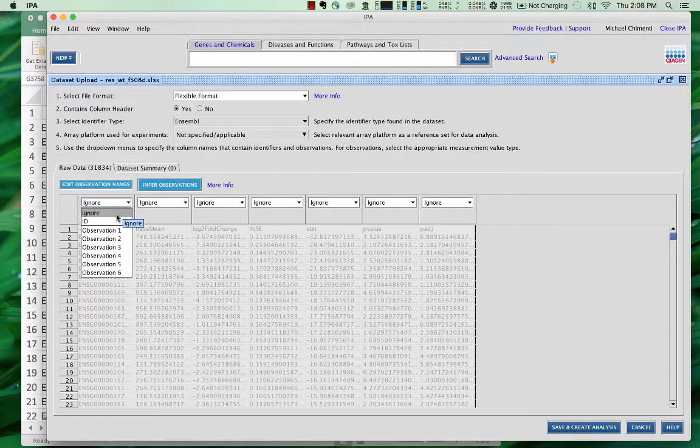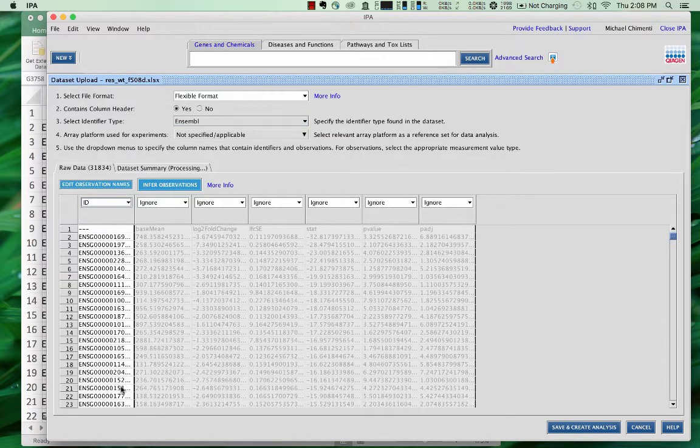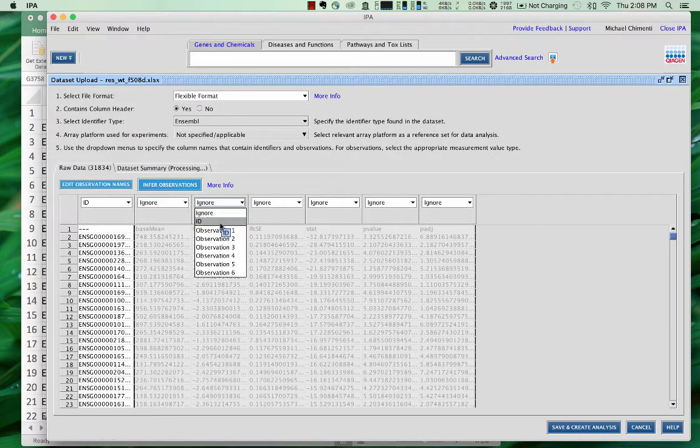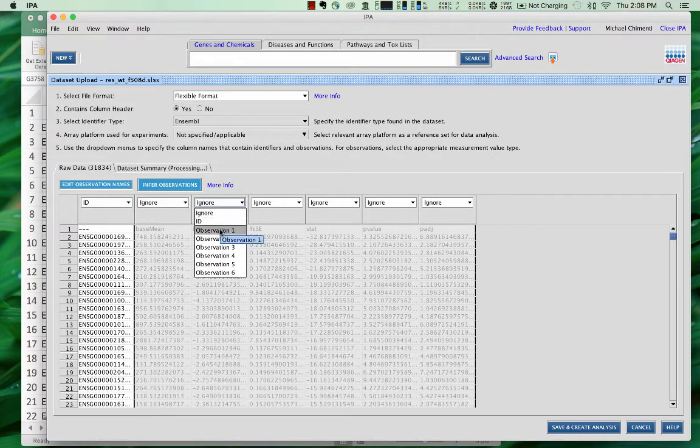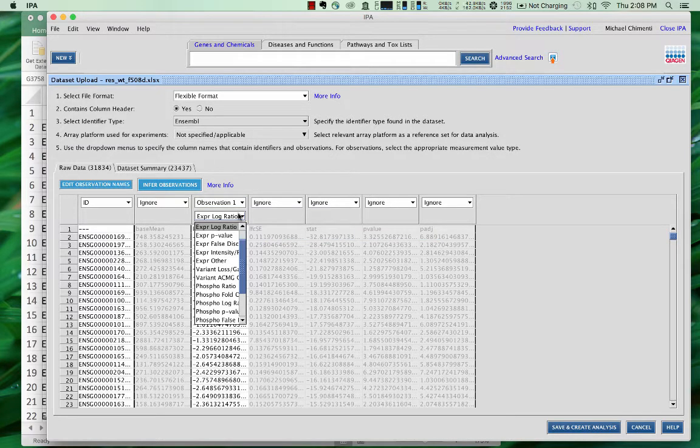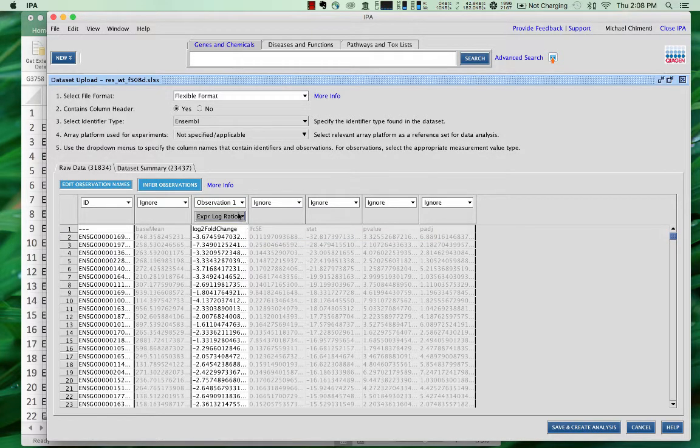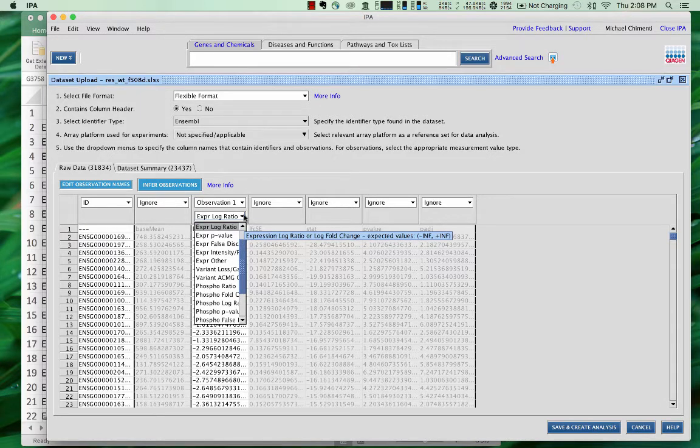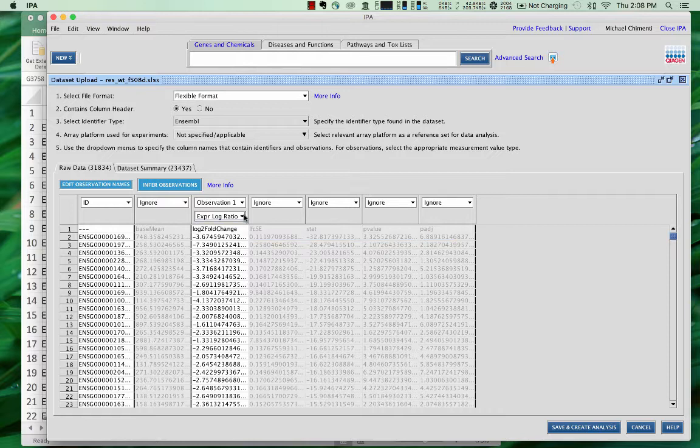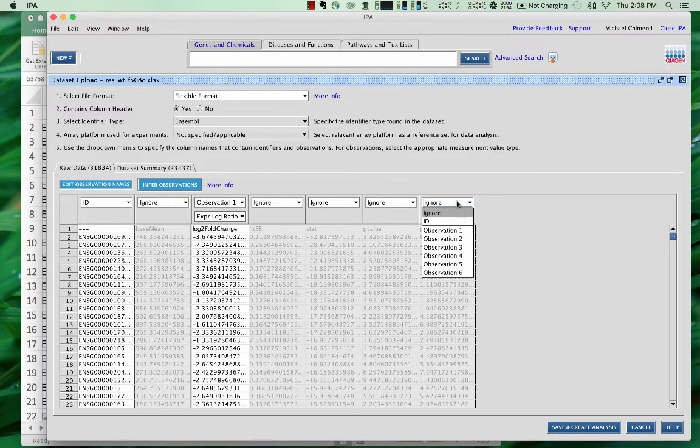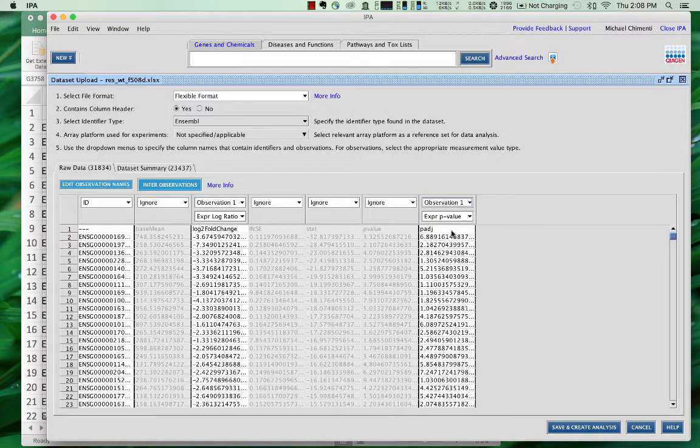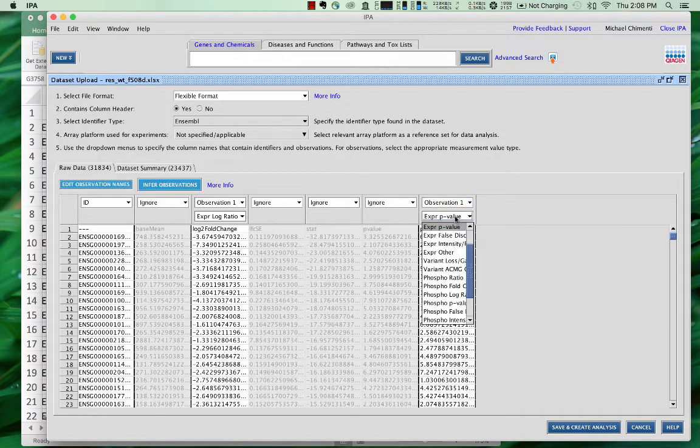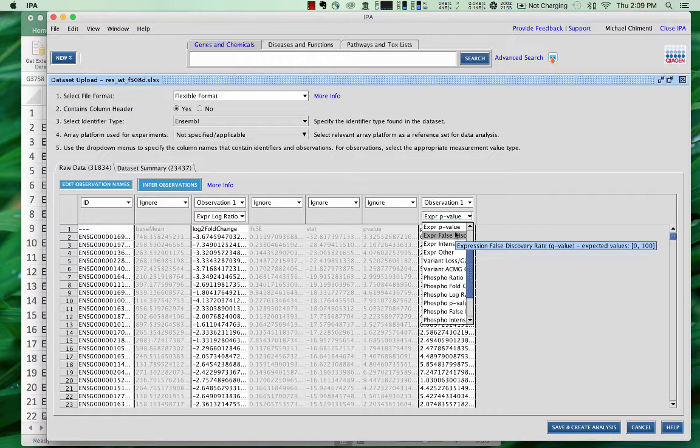Now, we will put this column to ID, so telling it that these are the gene IDs, and now we care about the log 2 fold change, so we'll call this observation 1, and expression log ratio, or log fold change, so that's correct. And then we want to also give it the adjusted p-value, so we'll put this also to observation 1. And expression false discovery rate.